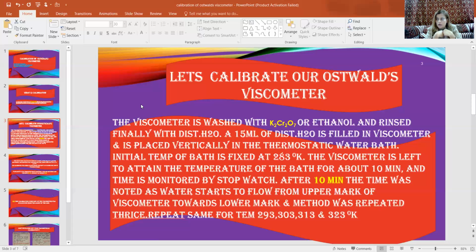I have personally worked on this Gallenkamp viscometric bath, so I know how to operate it. I know very well. At the Dr. M. Chem Institute of Chemistry, I used this Gallenkamp viscometric water bath by myself. I used to wash it. It's very heavy.